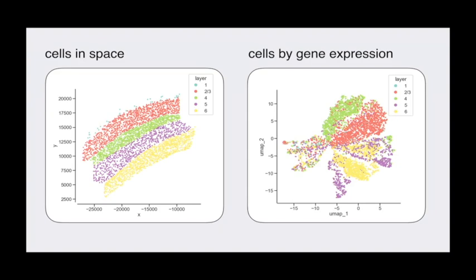Cells that are nearby in this UMAP space also have similar gene expression patterns. You can see, for example, that these layer 2, 3 cells in red also form a nice cluster in gene expression. So they're similar according to both a neuroanatomist looking at morphology and also in terms of their molecular properties. And I can also explain away all the funniness in here, if anyone wants to talk about that later.